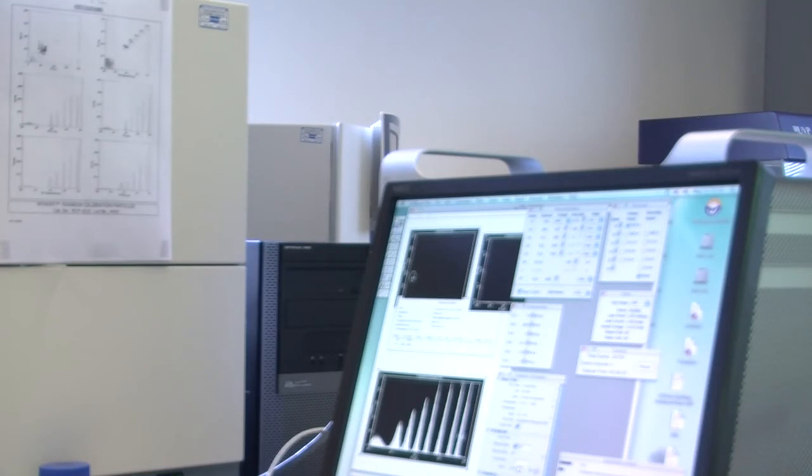F for fat, S for spotty. Yeah, that's a good way of remembering it. Forward and side scatter: F is for fat, S is for spotty. So you've got spotty cells, and you've got fat cells, and you've got fat spotty cells, and non-fat, non-spotty cells.